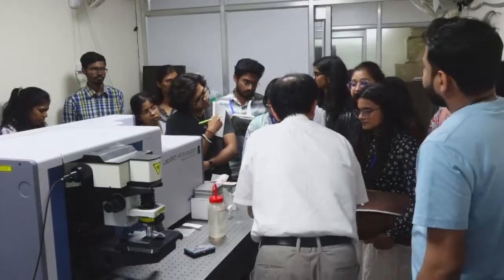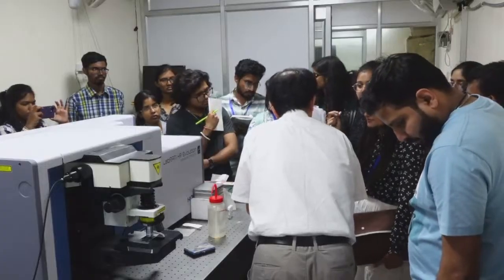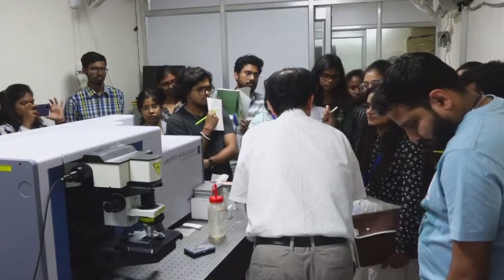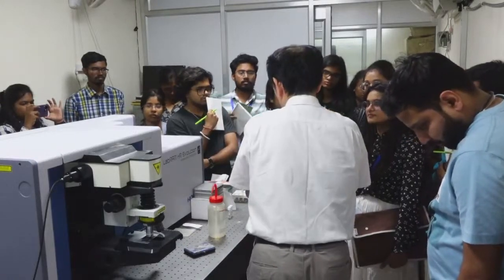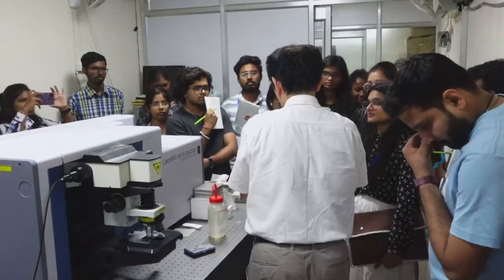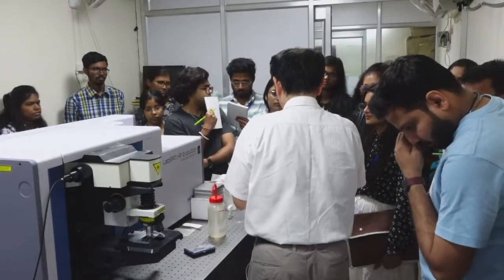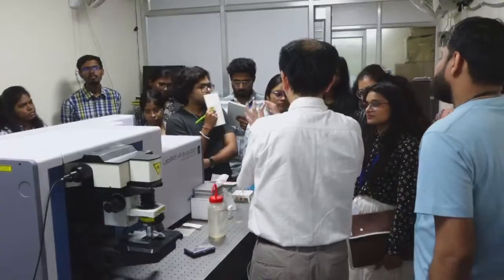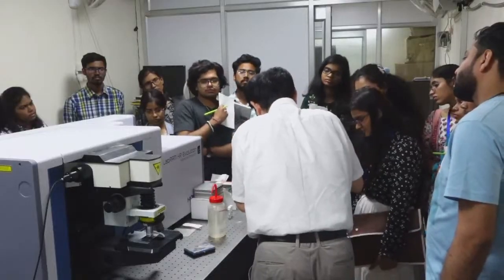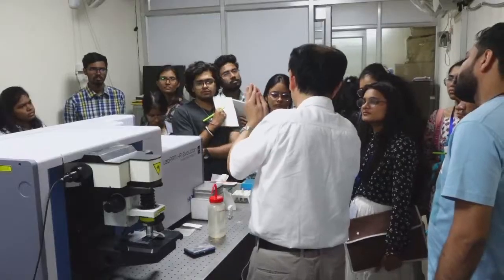It may vary if the thickness of the sample is large or small, very thin or very thick, it will also affect the intensity of the Raman spectrum. Actually, Raman signal is generated from the focal point. If we see the top, it looks like a focal point, but if we see in 3D, then it's a focal volume.